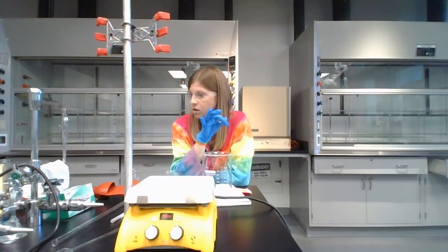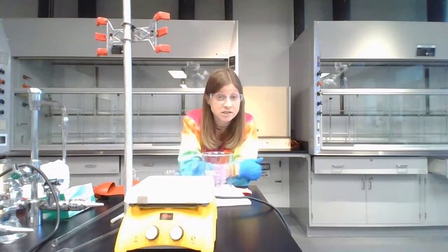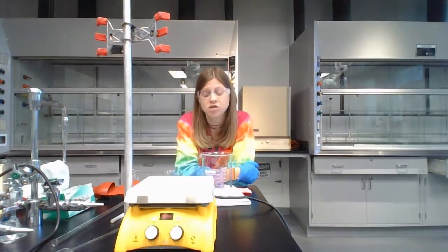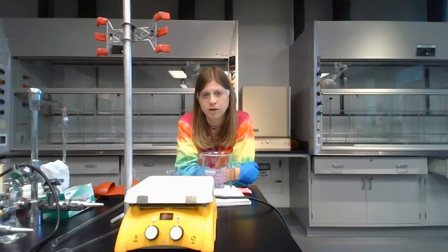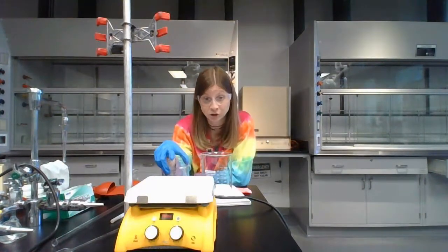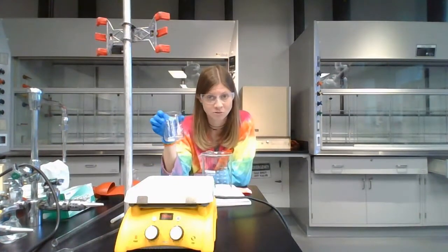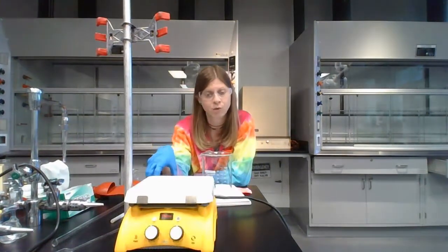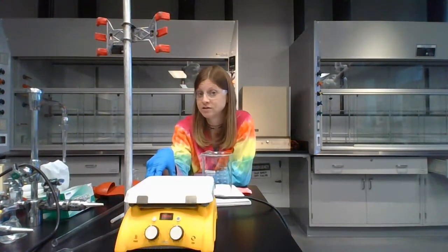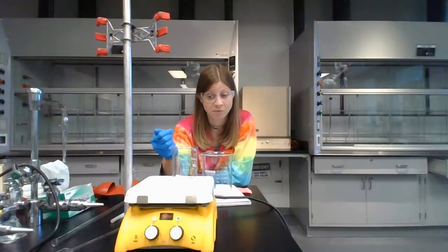So the thing that's the most time consuming for this lab is honestly getting the solutions to 70 to 90 degrees Celsius before you can titrate. But don't think that you're smart by turning your hot plate on early. Do not turn your hot plate on until you have a beaker on it, because what will happen is if you turn your hot plate on early and then you set your cold beaker on it, it's going to break the beaker and the solution's going to spill everywhere, and this is not the lab to make big spills. So don't turn on your hot plate until the solutions are on it. Then you can turn on your hot plate.